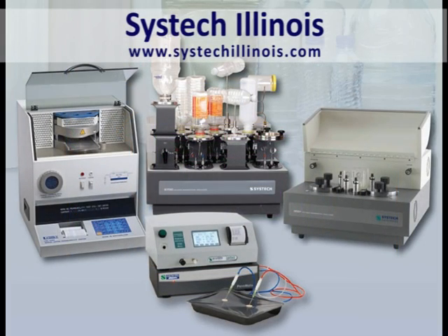Well that concludes a short introduction to the Systech Illinois 8001 Oxygen Permeation Analyzer. We have a whole family of permeation analyzers to choose from, so please visit our website.